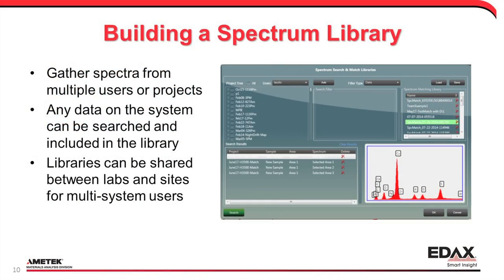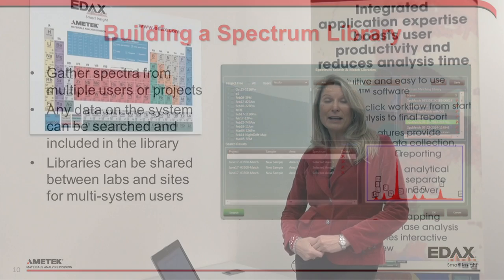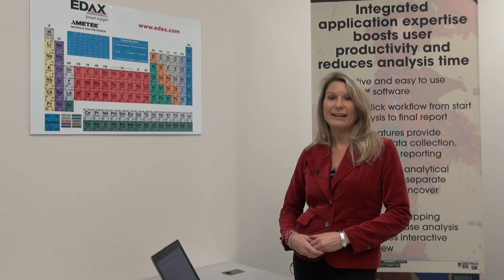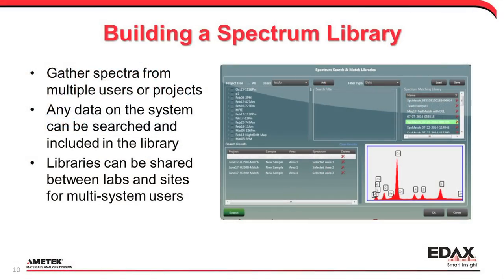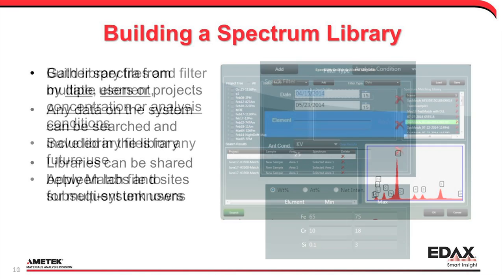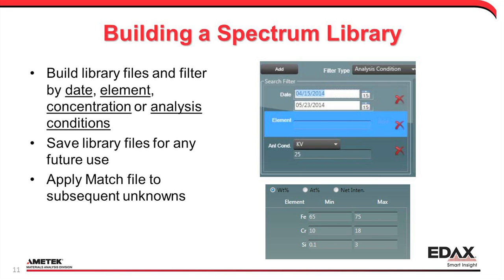The spectrum library program works in two parts. The first part is building a library of materials, and this is done on any EDX Team system. Even if you've had your system for many years, you could go back and search through the entire database of your spectra to create a library. You can also search by different parameters — for example, filtering by date, elemental concentration, or analysis conditions. That library can be saved.